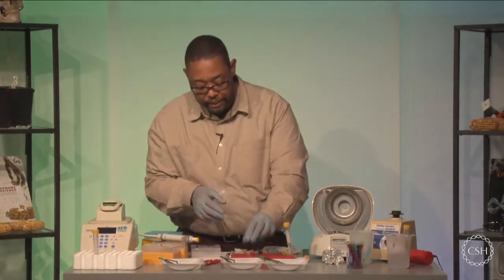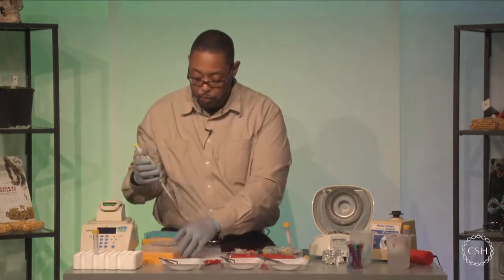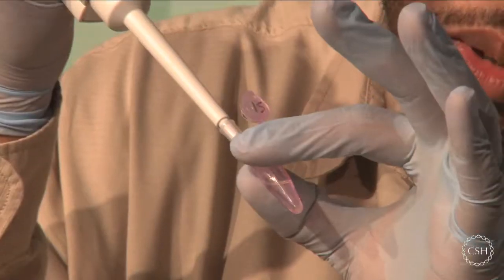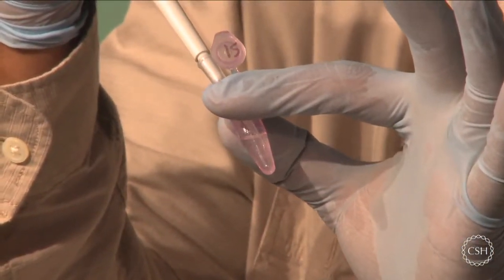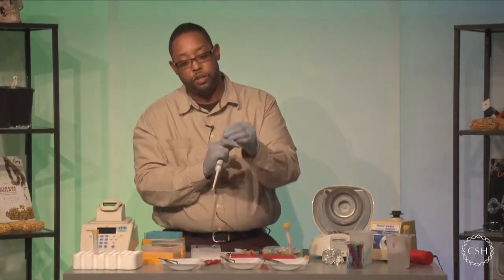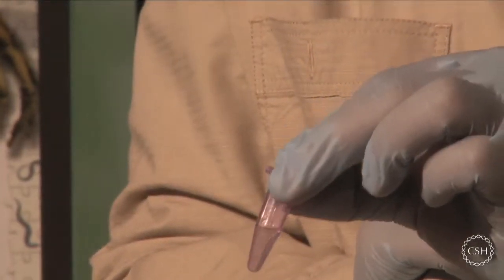Okay. The last thing that you can physically try to do is to take a P100 set to 100 microliters, and we can try to physically get down in there and pipette the pellet up and down. So I'm going to go in here with my pipetter, and all I'm going to do is draw up the silica resin and pipette it back and forth. And here you can see that I'm actually breaking up the silica resin pellet once again, and it's distributing throughout the liquid here. And this is good because we're getting good washing all the way across. So you can also invert a few times to make sure that you're getting good mixture after that type of wash, okay?